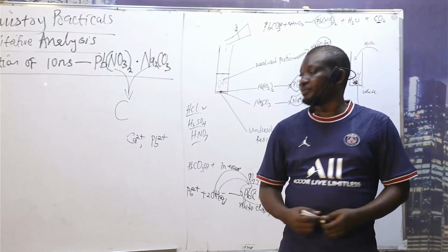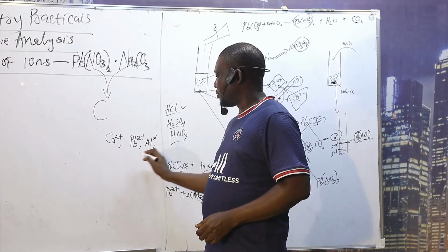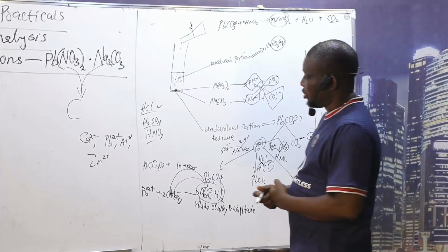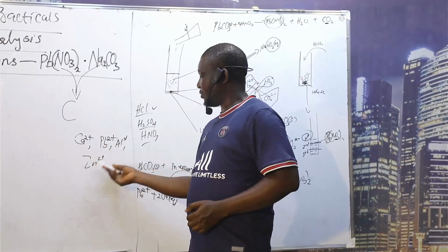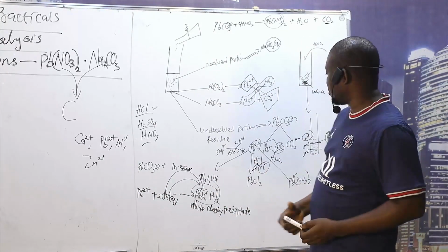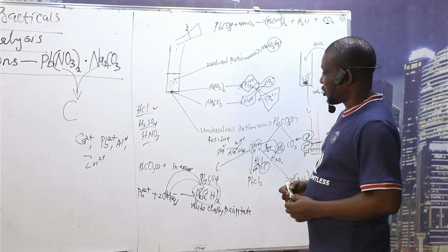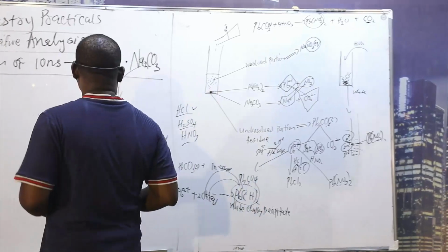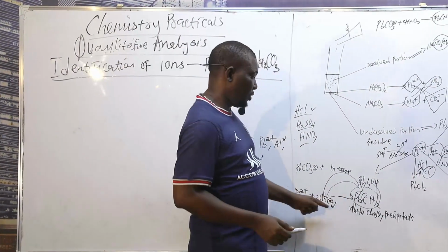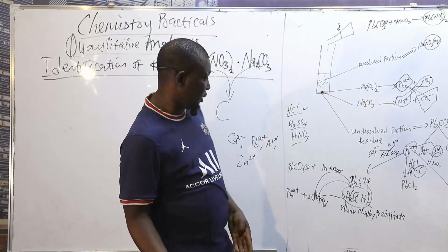The second portion also, you will have these 4 cations. That is why you should go to the next portion to know. That means you now have this, you are suspecting, okay, to be the salt. You are not too sure, so you go check out the second portion. Maybe this time you are using aqueous ammonia. Yes, with aqueous ammonia, the same thing will happen. White precipitates or chalky precipitates will still occur. You're going to see it in the experiment.